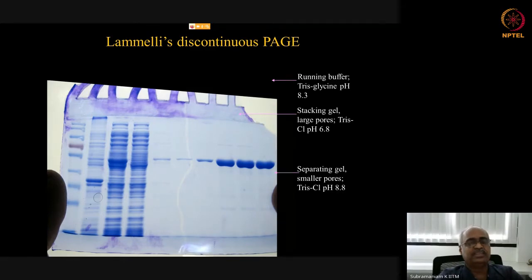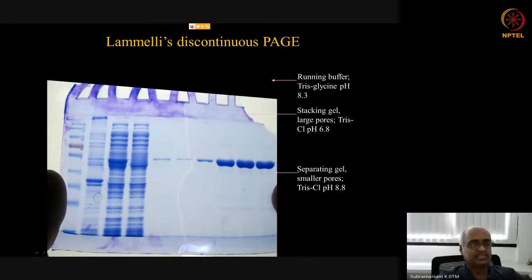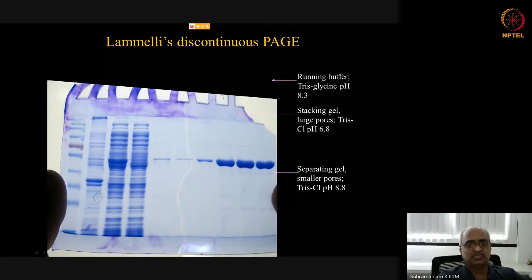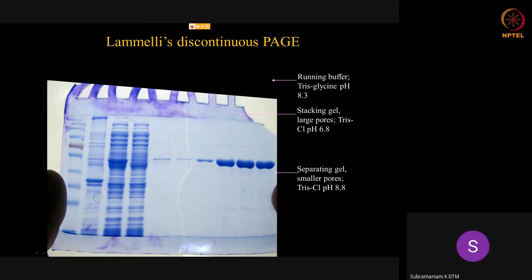And due to that, it is a thin sheet of gel, and to load sufficient volume of liquid, and by sufficient volume I mean in the range of 10 microliters to 50 microliters, this is going to be a long comb-like structure. So you can see here it extends some more. It's usually about a 1 to 2 centimeter deep well. Now when you add liquid, let us say it fills this much, and when it is homogeneous, the same protein molecule will be present here, here, everywhere up to the top. So you have a column whose height is about 1 centimeter, let us say.